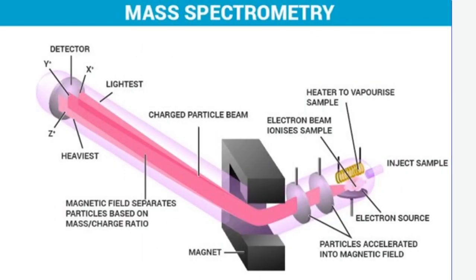Now we can see in this slide a figure that shows the composition of the mass spectroscope.